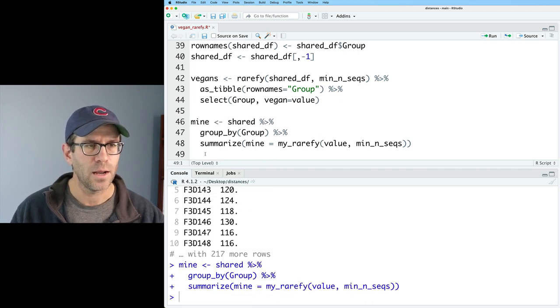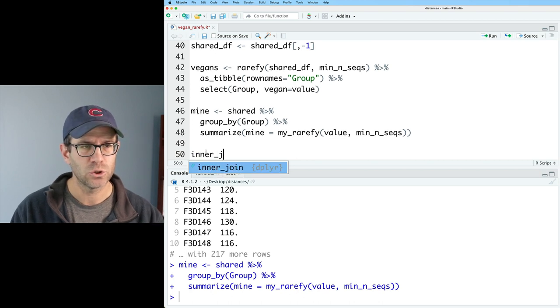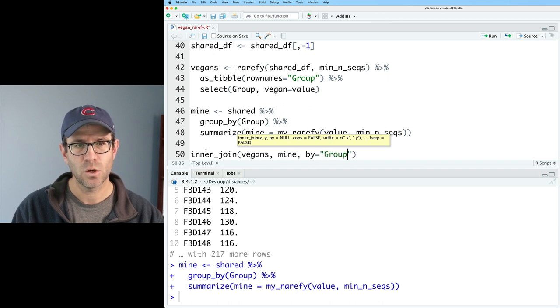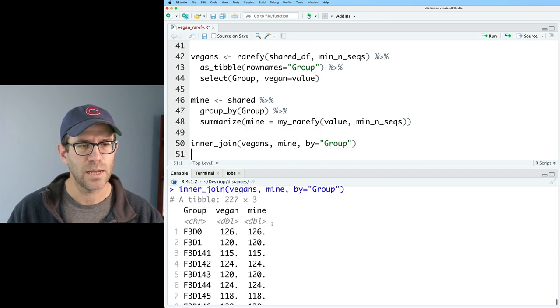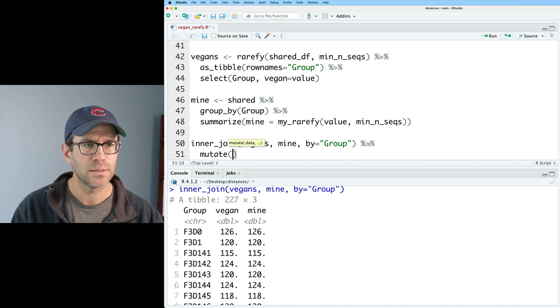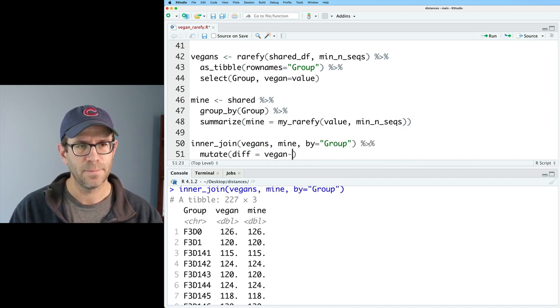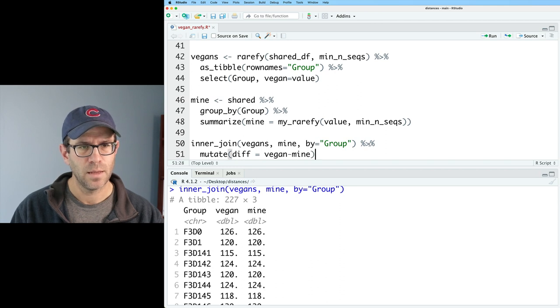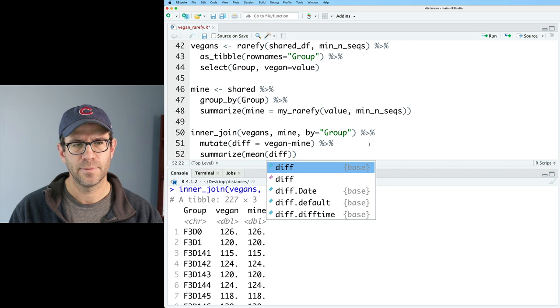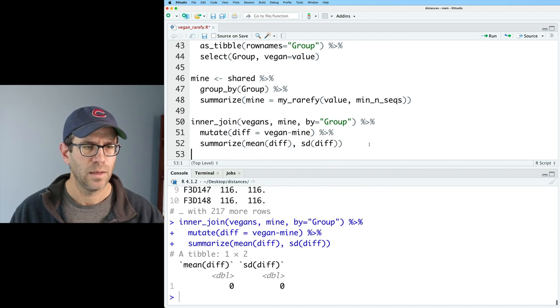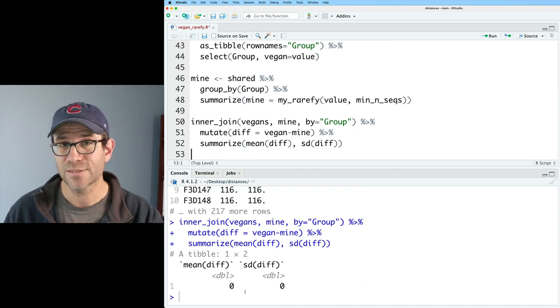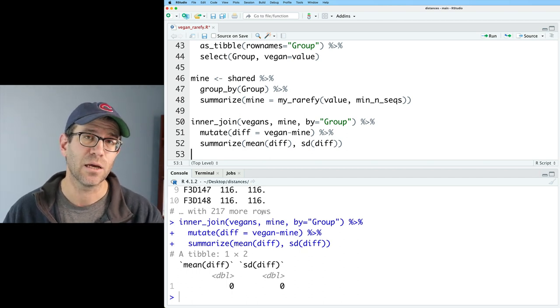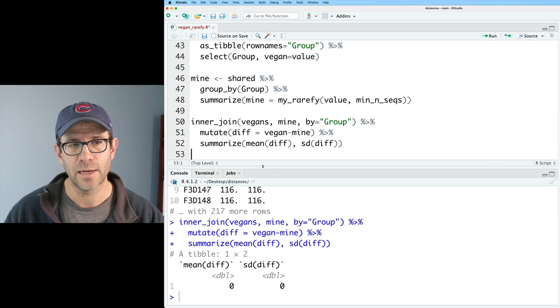And then we want the value column, and we'll do it to min_nseqs. And this then gives us my output, right? And I'll then call this mine. And then I will do an inner_join between these things. So I'll do inner_join vegans, mine by group. And so now I've got those two columns. And I could then do a mutate. I'll call it diff of vegan minus mine. And I'll go ahead and do a summarize mean_diff and sd_diff.